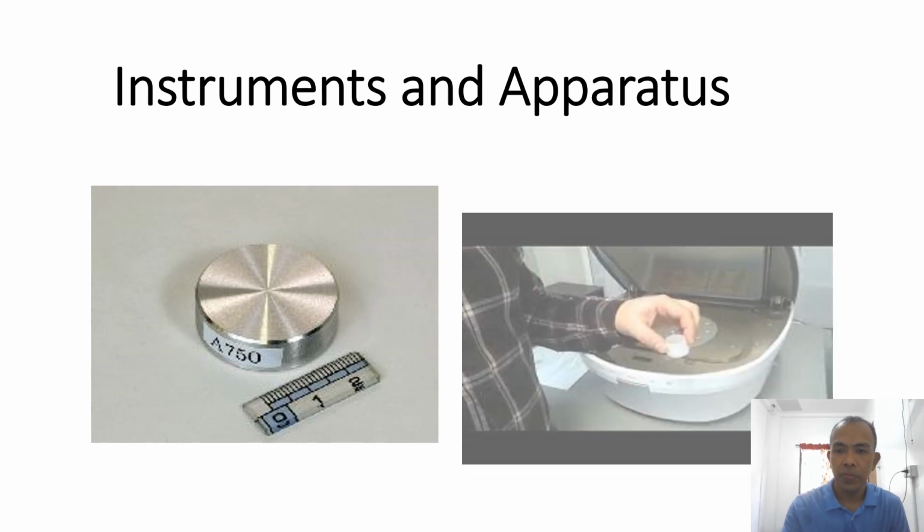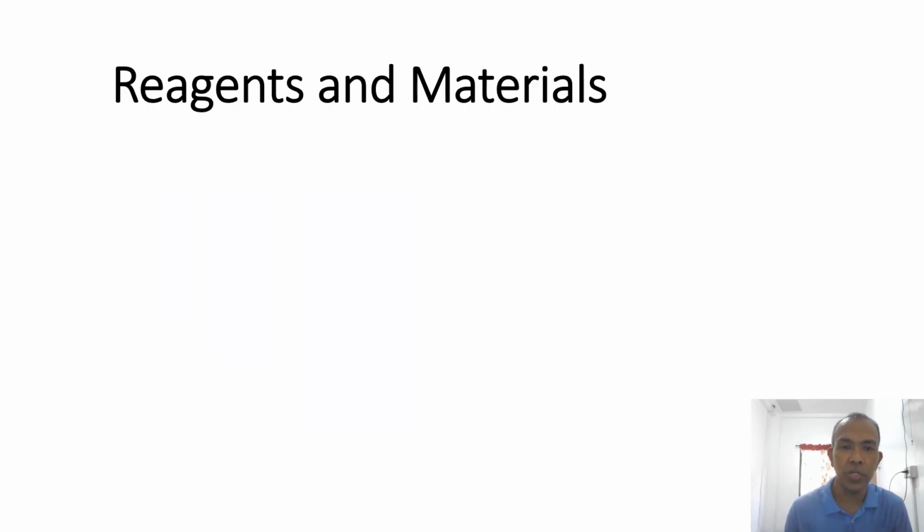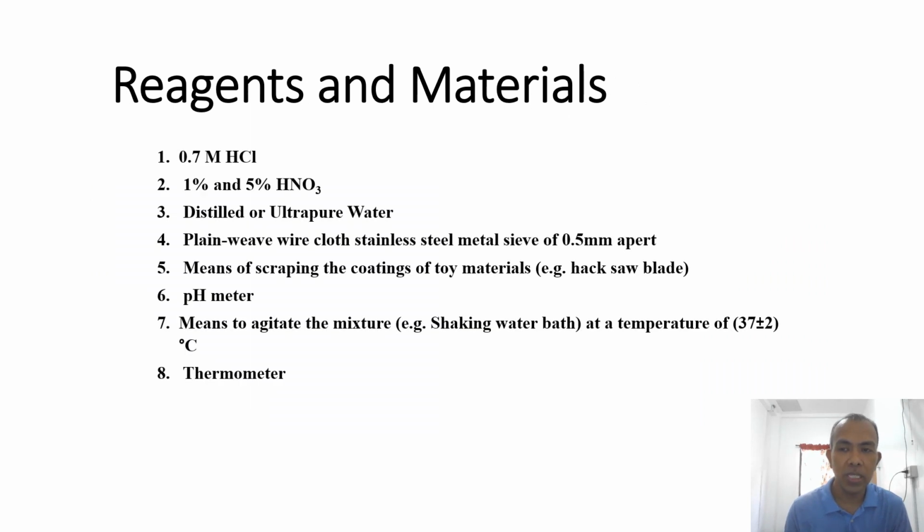And then, this is how you place it in the sample holder, and meron siyang accessory, parang carousel, to place multiple sample holders in one reading. So hindi ka na papalit-palit pa ng cuvette or ng sample holder. And then this is what we need in this analysis for the extraction, for preparation of sample, the following.